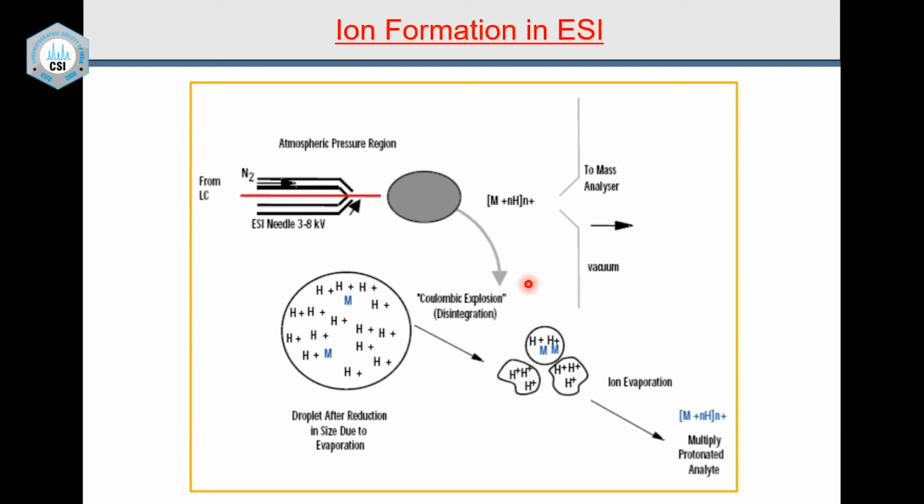And here it is important to say, with this slide, when you have the molecules there, please look into that. You have the molecules and you have the protons here. Now the protons come generally from your solvent front. Let's say that you are using water, in reverse phase you use a lot of water, or there will always be some water molecules present. And the water molecules will present a proton, or your solvent front will give a proton, or your buffer will give a proton or an adduct ion, and the neutral molecule will get added onto this proton.